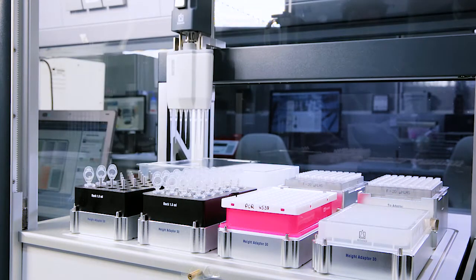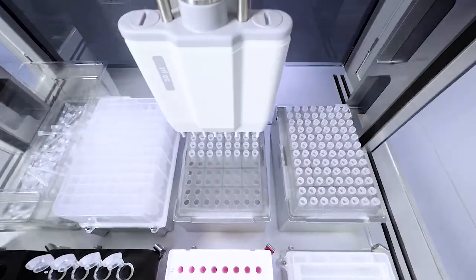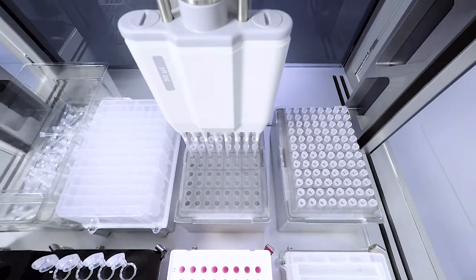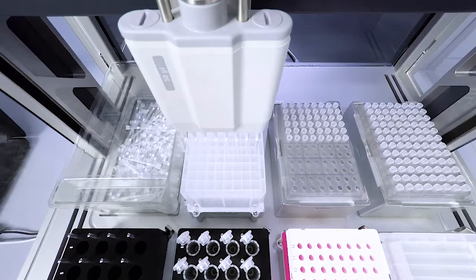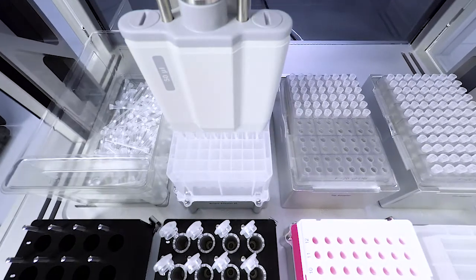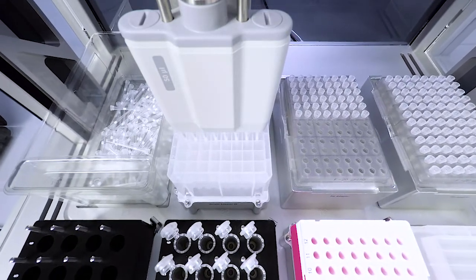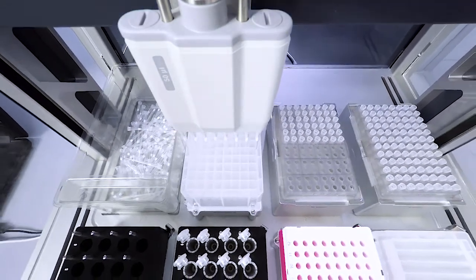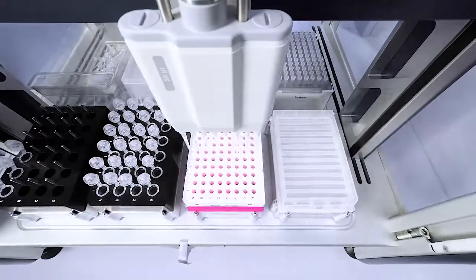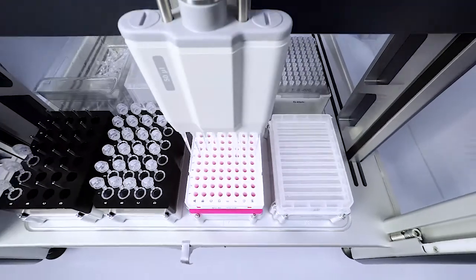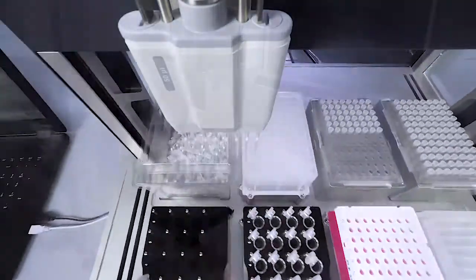One transfer command covers all tasks like pipetting, multi-dispensing, cherry picking, etc. The liquid handling station is as easy to use as a manual pipette.